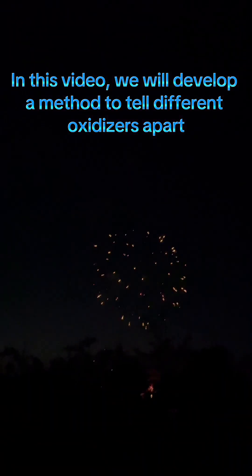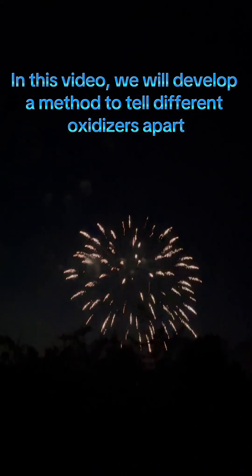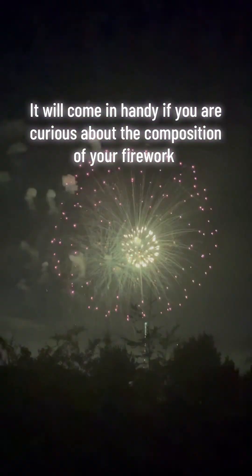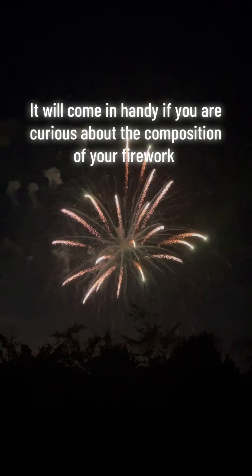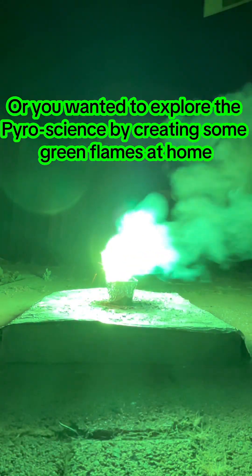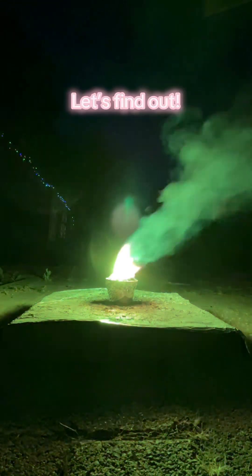In this video, we will develop a method to tell different oxidizers apart. It will come in handy if you are curious about the composition of your firework, or if you wanted to explore the pyroscience by creating some green flames at home. Let's find out.